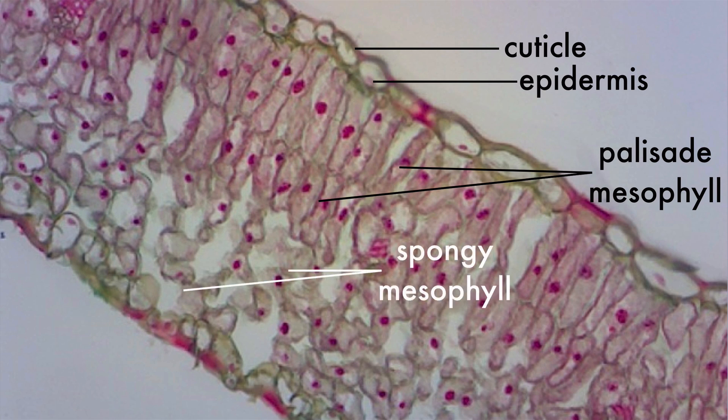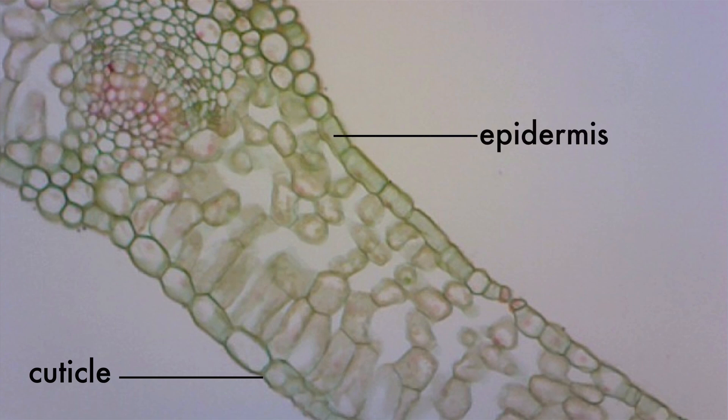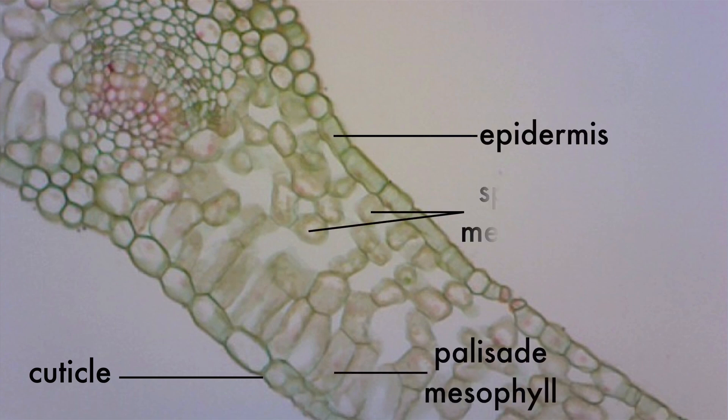The stomata aren't very easy to spot on this slide, so let's look at another one and see if we can spot it. Again, we have the cuticle, the epidermis, the palisade mesophyll, and the spongy mesophyll.